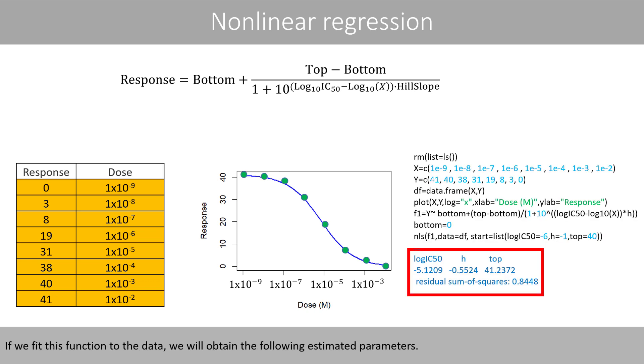If we fit this function to the data, we will obtain the following estimated parameters. Note that the hill slope is now negative, which is expected since the curve now has a negative slope.